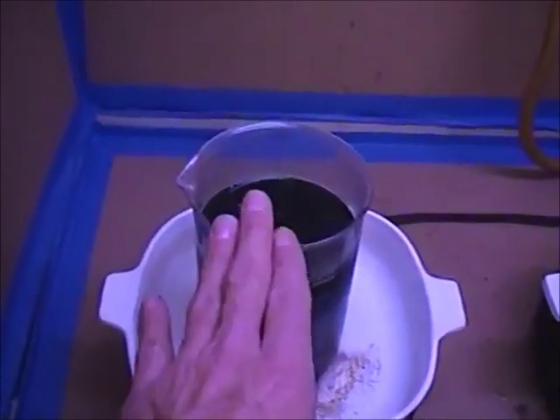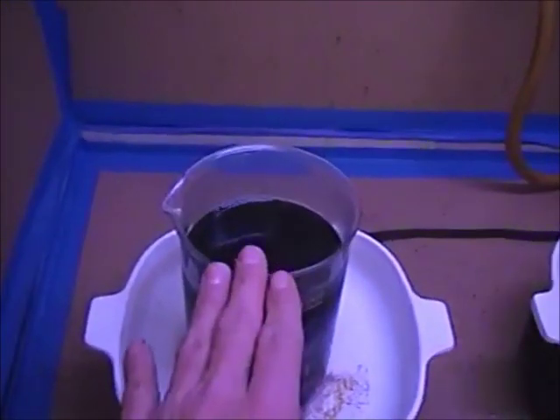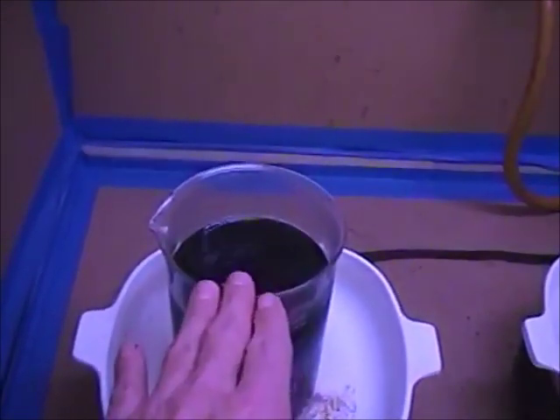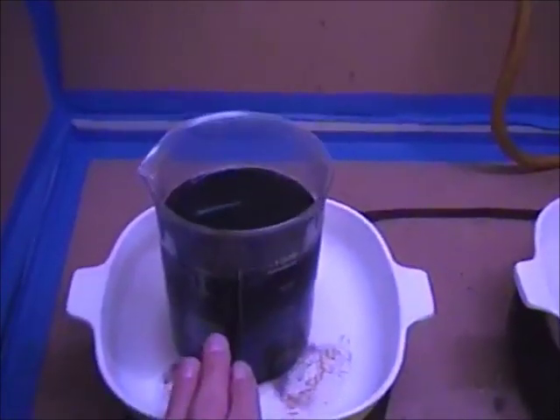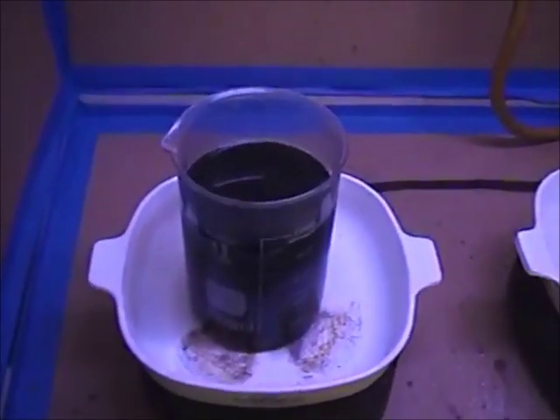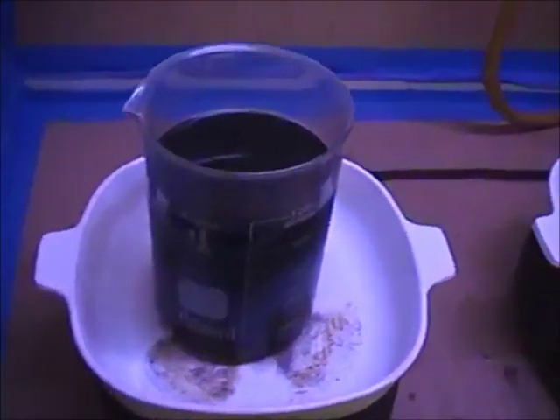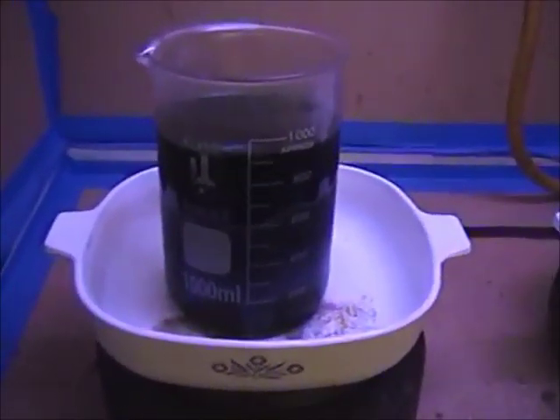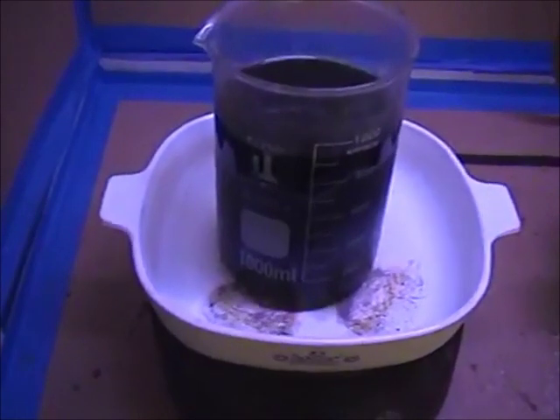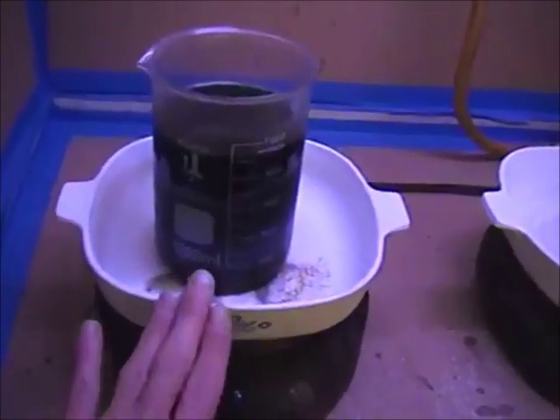So the first thing we're going to do is add some 30% sodium hydroxide solution to precipitate out some of the metals as a hydroxide. By adding more water with the sodium hydroxide, we're going to dilute this solution, and the solubility of those metals in a dilute solution is less than it is in a concentrated solution. Now, if you look, there is almost 1,000 milliliters of solution here. We're going to be adding our sodium formate solution as well as our sodium hydroxide solution, so the volume of this solution is going to grow.